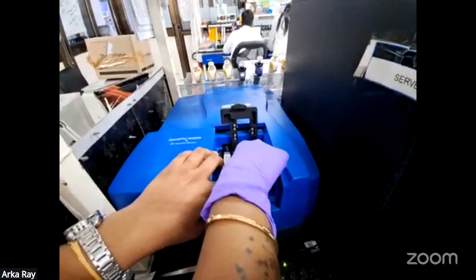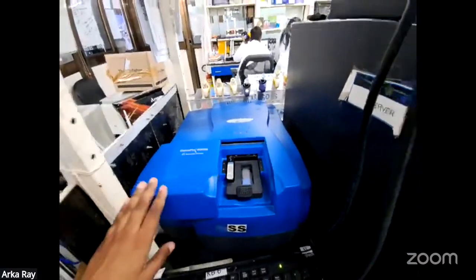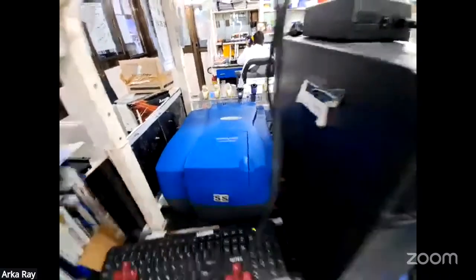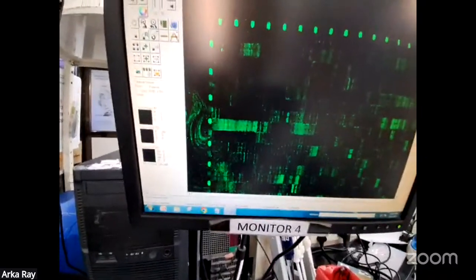Right. So again, it highlights that on a very small glass slide, which students use for different experiments, one could have thousands of spots of peptides or proteins, which in a very miniaturized way represent the entire proteome. And that could be screened with high density arrays.